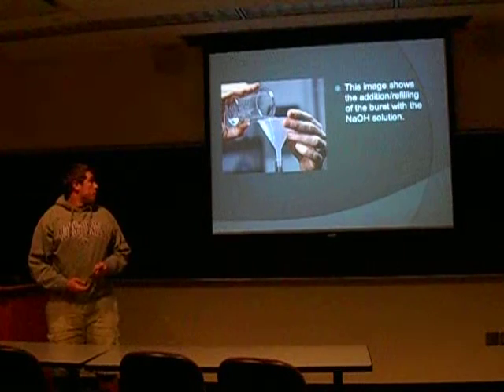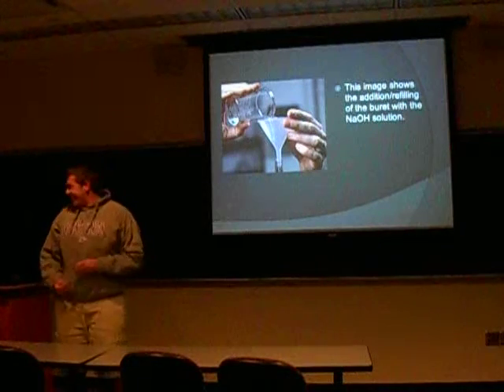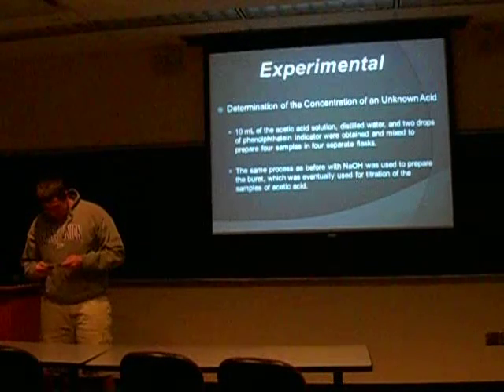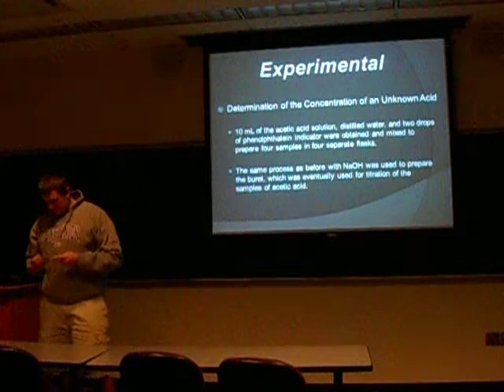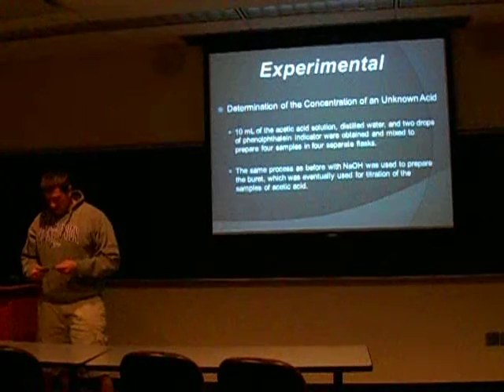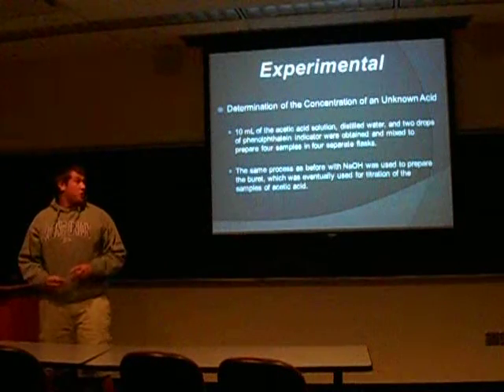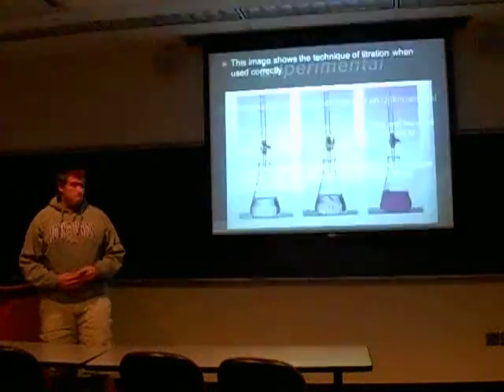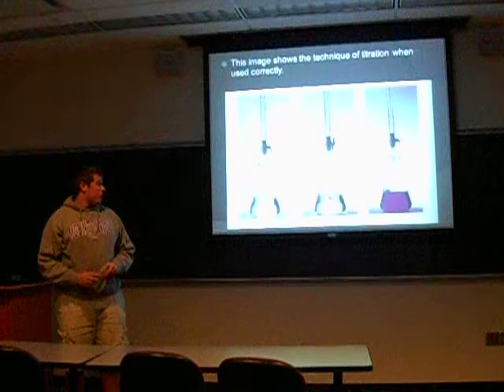This is just us adding the sodium hydroxide to the burette. Used 10 milliliters of acetic acid and distilled water with 2 drops of phenolphthalein, and we put sodium hydroxide in the burette for the unknown. And then this was the technique that we used.